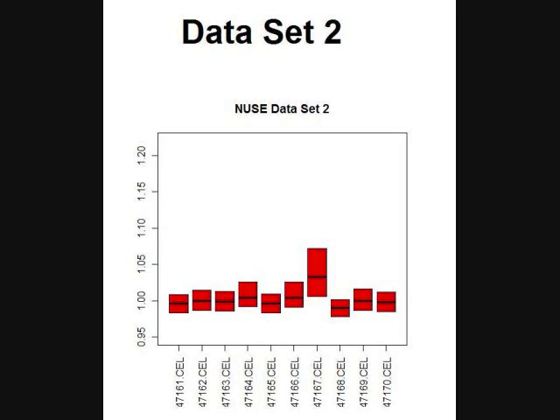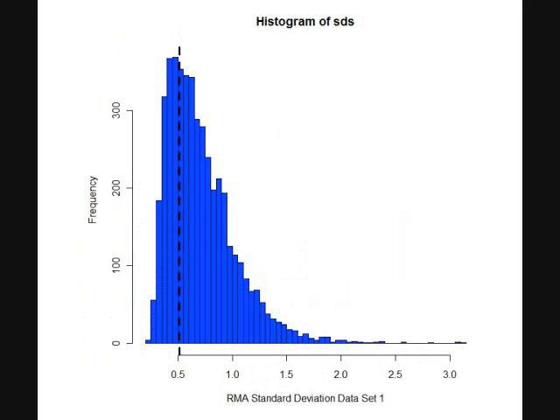Again, here is a NUSE plot. The more evenly distributed and flat they are, that means that there's not really an outlier. If you look on cell 47167.cell, that one's much higher than the rest of them. That one's an outlier and that data is not as normalized as the rest. It should be examined.